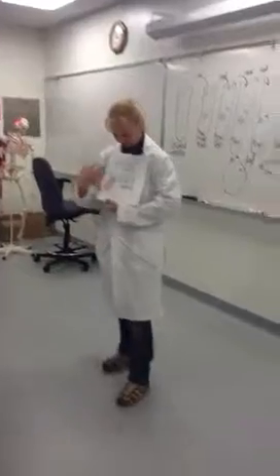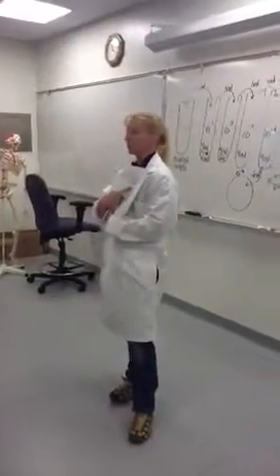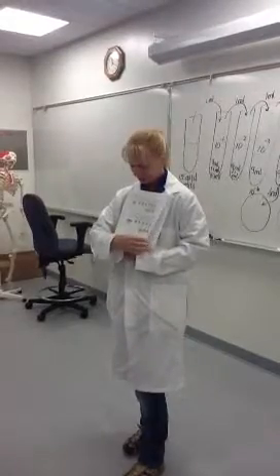There's a couple of practice problems for you on here. So on this one, the plates are already counted for you. It's got the number written in there. So when you do your calculation on there, you just figure out what the dilution factor is. You pick the one that's between 30 and 300 and go from there.